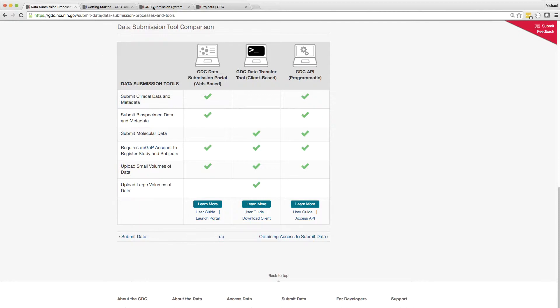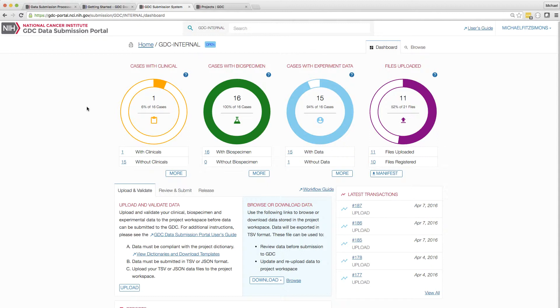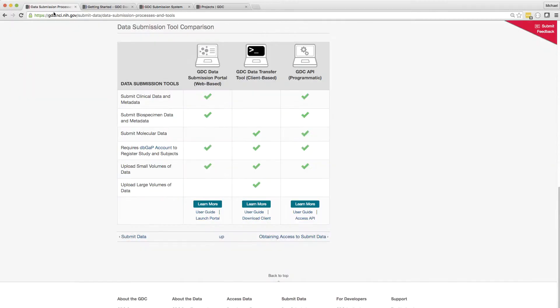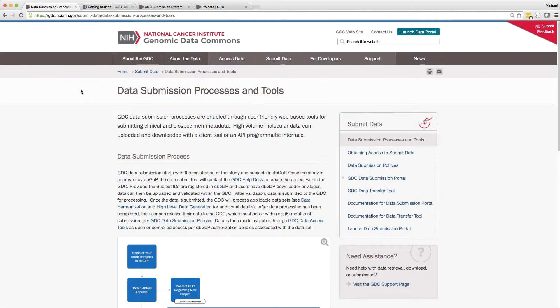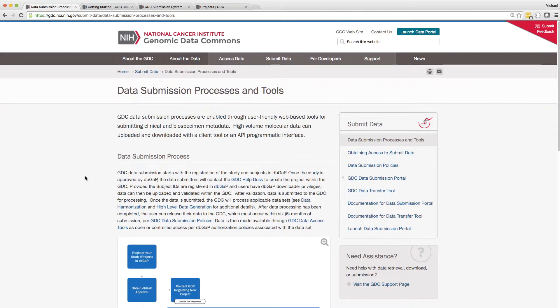Use of the DTT for data upload requires that you have already set up a project and uploaded all necessary biospecimen and experimental metadata. You can see more about those topics in the Submission Overview and Submission Portal videos. The Data Dictionary and Data Model pages are also excellent resources for understanding how to provide this information to the GDC.